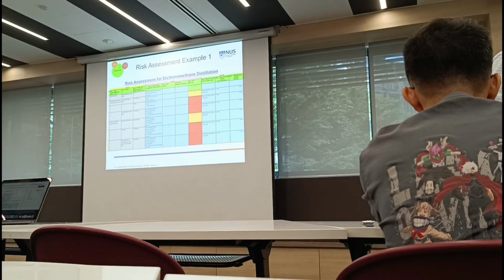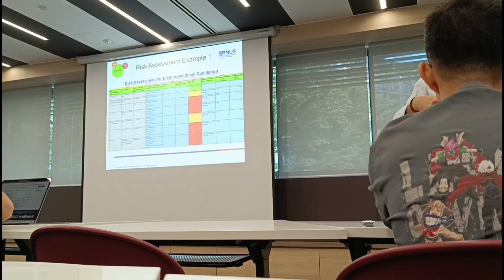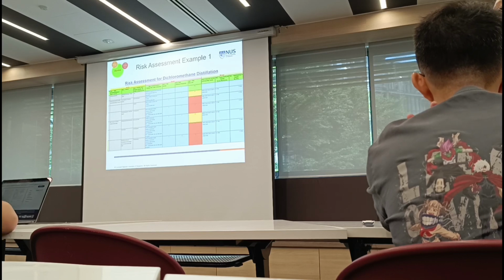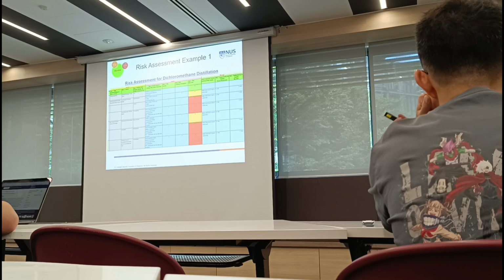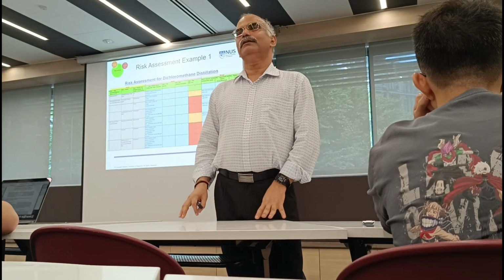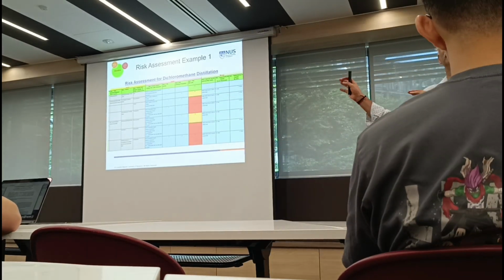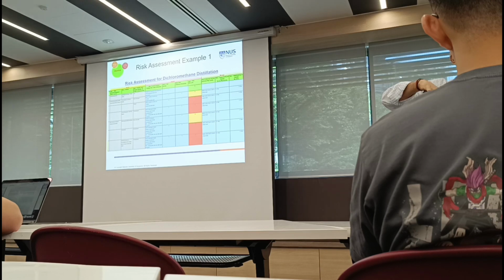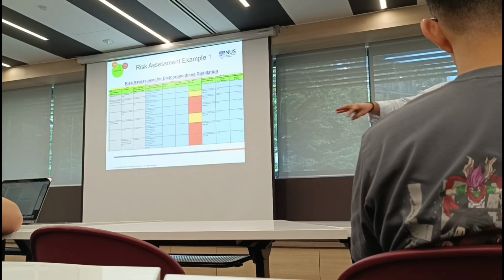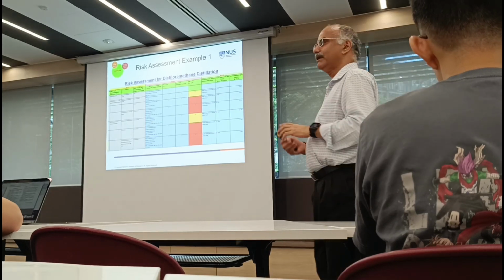If there is a fire hazard, then definitely severity will be high. If it is something else, because the lab had many other incidents, then likelihood will be high. So these are things you really have to think about and do the number, not just randomly put 1 or 2, and then you get into trouble. Okay? So again, remember, you are doing risk assessment for what? Not just as a procedure, right? It is actually for you to analyze the risk associated with that particular experiment.